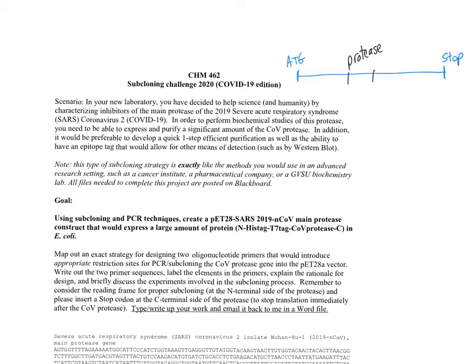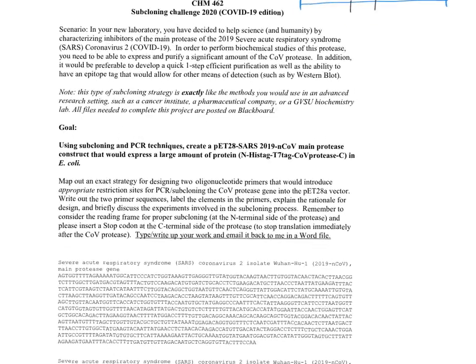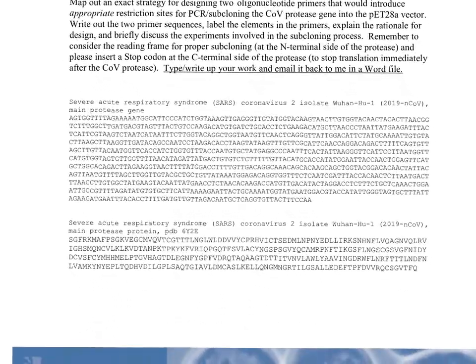Once this protease is snipped out, the whole thing is translated into this gigantic protein and then snipped out into its components, which fold and become the parts of the virus that assemble. The interesting thing about this protease is that a lot of people have been looking for the same things that we have seen in other open reading frames, which is an ATG, and this one doesn't have it. If you look, this is the sequence right here, and it took me a long time to get, of the DNA that we care about, that we actually want to subclone out.